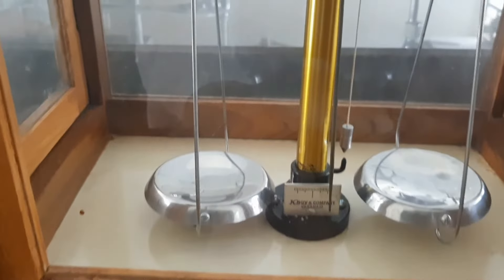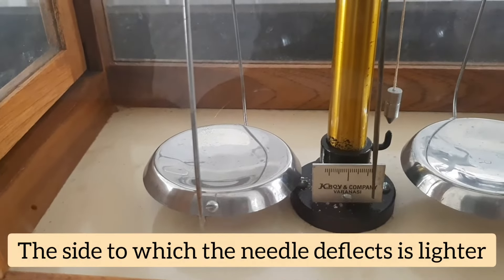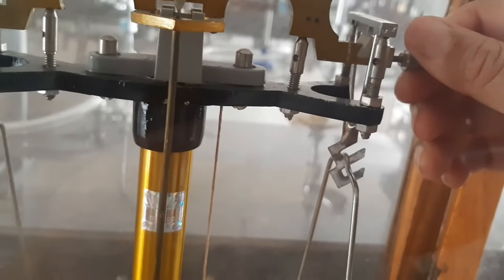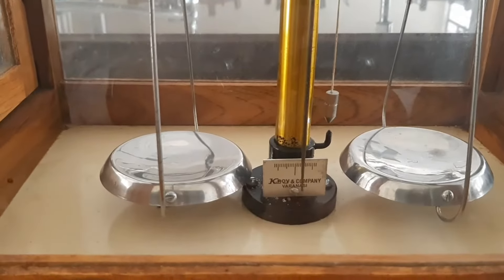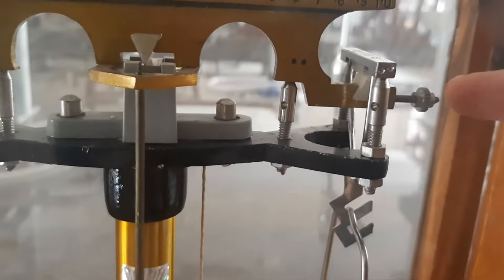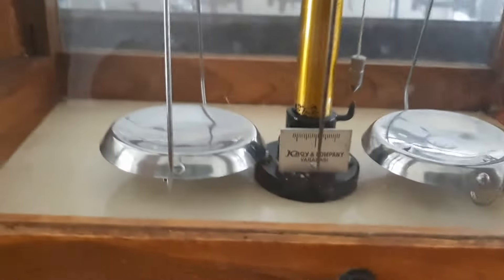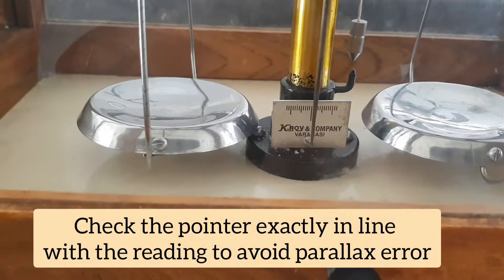I'm moving the center knob in the clockwise direction — you can see the central needle is moving towards the right. That means the right-side pan is a little lighter; the side to which the needle moves is the lighter side. So I'm going to make an adjustment from this side, moving this screw, and ensuring the pointer is read without parallax error.